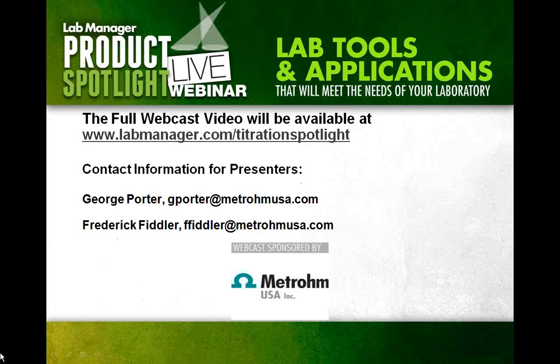We're aiming for the mid and upper range with this technique, because as you would imagine, we're measuring that temperature change, and that heat is going to be very dissipated at a very low content, and so we do not have a clear-cut answer to give in terms of what is the minimum detection limit for all different types of oil samples.